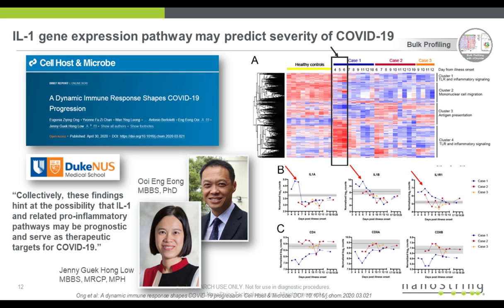This gives you an idea of some of the things that we're measuring. These are blood profiles, and if you just look at those heat maps there, these are COVID-19 fatalities, and you can see 3 case studies on the upper right graph. You can probably just use your eyes, I don't have a pointer here, so you're going to have to bear with me. You can look at case 1, case 2, and case 3, and among the 770 genes that we were measuring the digital expression on, you can see the different color patterns associated with the response of those 3 different cases.